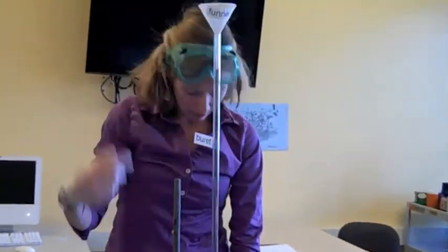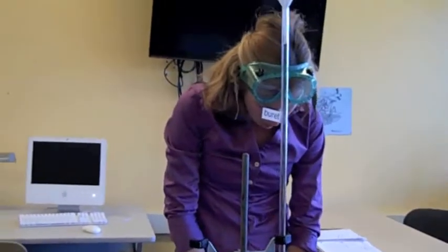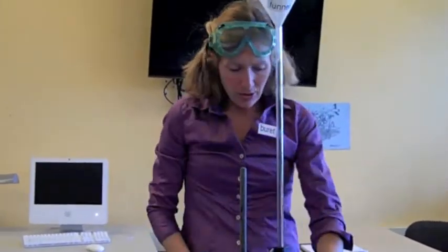Initial volume of acid in burette. 50, right there, if you got it right on the money. If you didn't, that's okay. Just write down, maybe you got 49.5. Okay, record initial.